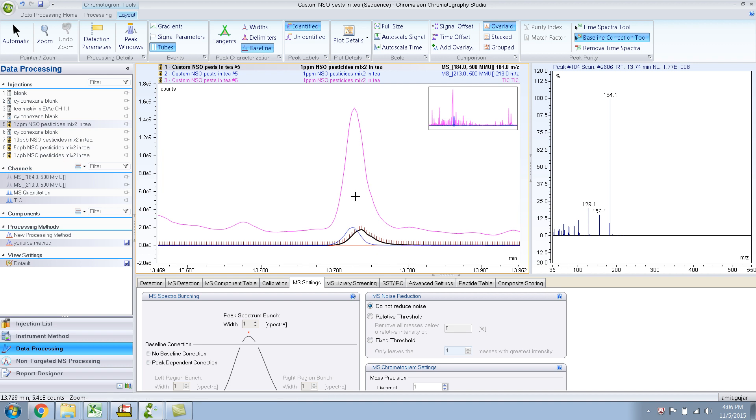So yeah, that's it. That's what I wanted to show - the use of this time spectra tool and the baseline correction tool, how you can manually subtract different spectra.